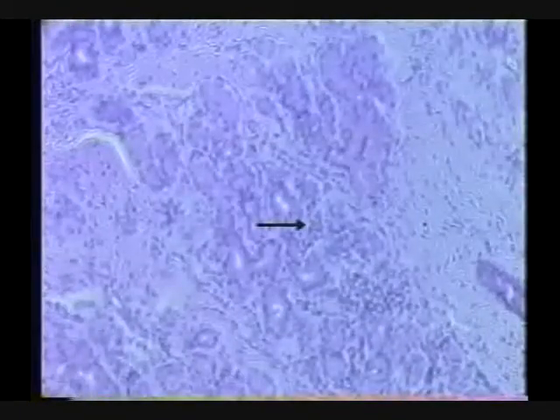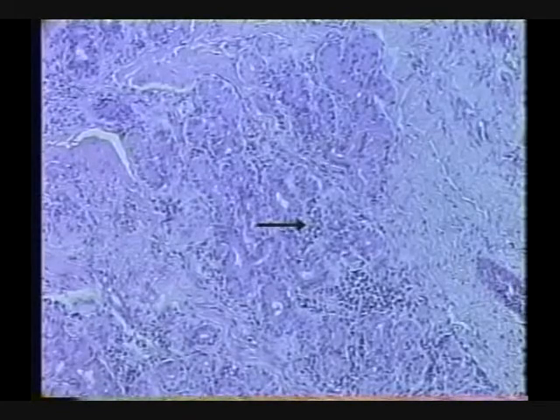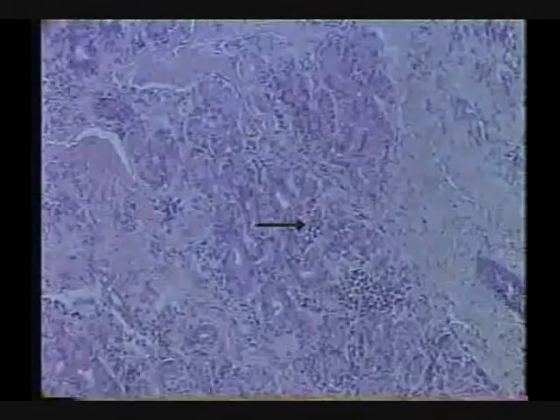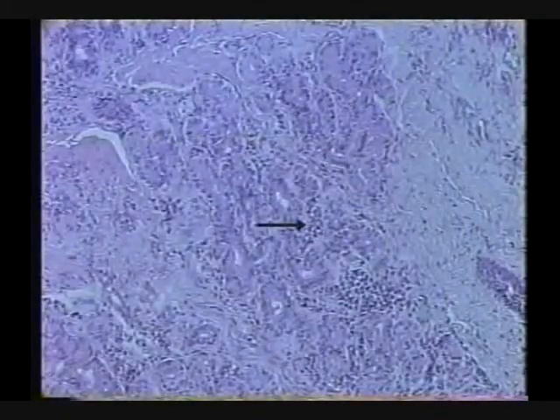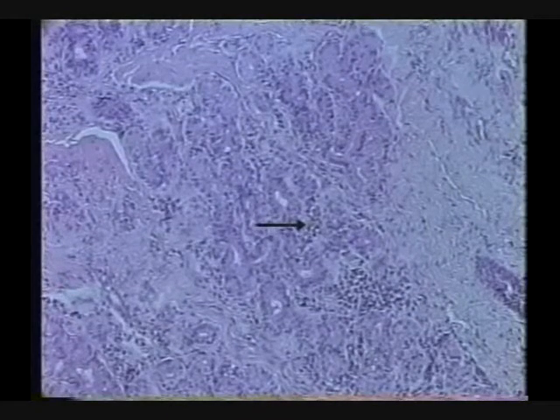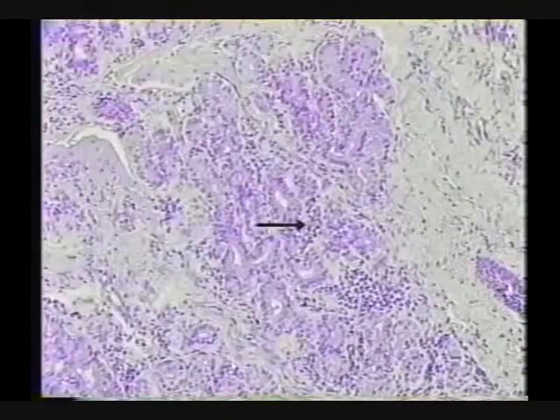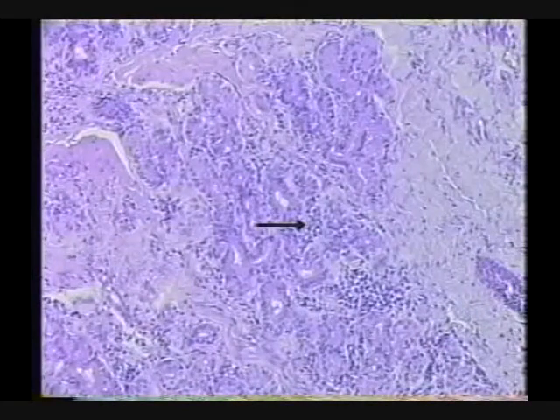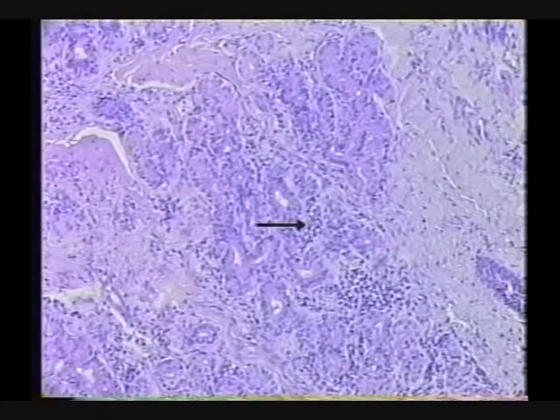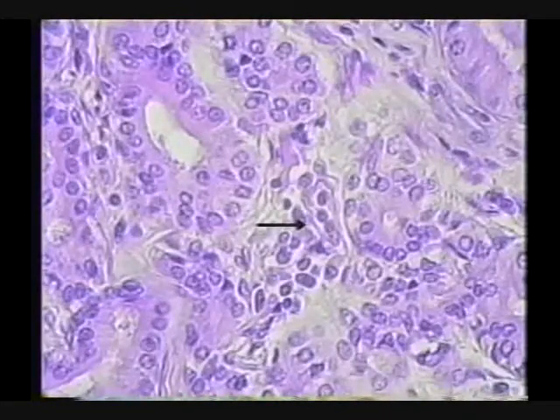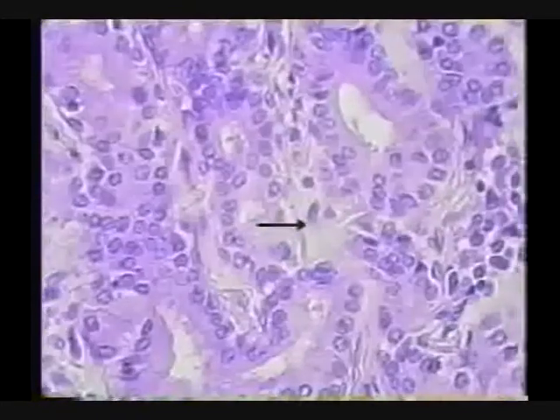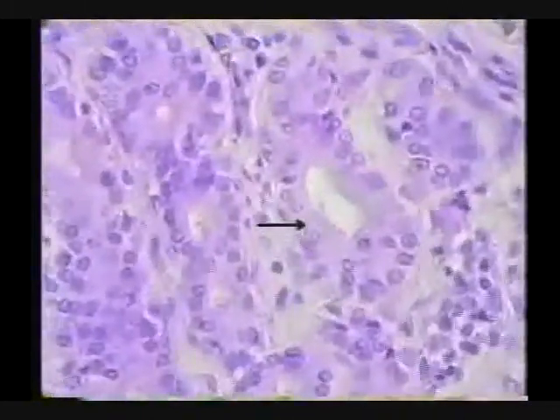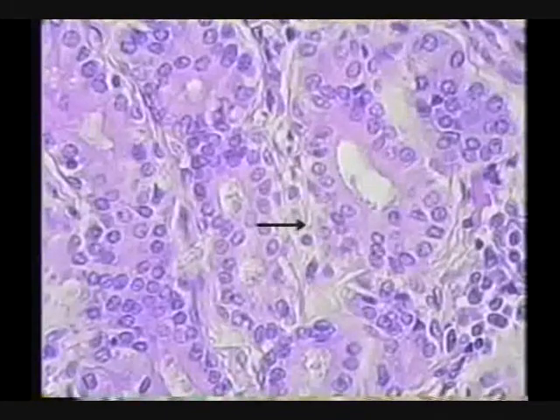All of this stuff in here, what do we think it all is? It might be serous and mucous type things. Looks like glandular material, ducts. These look like a lot of ducts to me. Okay, so anybody have any idea of where we are?